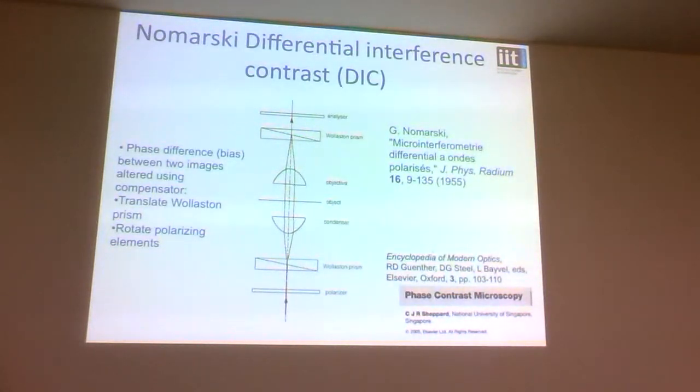DIC, differential interference contrast. So this is quite a widely used commercial system. I might add the DPC is not done commercially by anyone at the moment, as far as I know, but two commercial confocal microscopes have done it in the past. The Bio-Rad and the Olympus both used to do it, but they don't seem to do it anymore. I'm not really quite sure why.